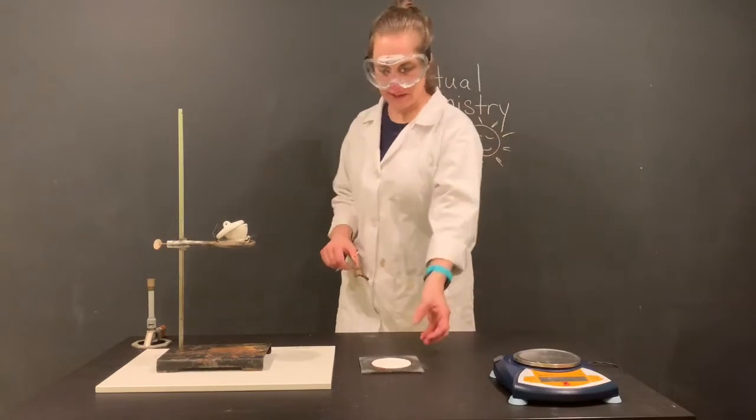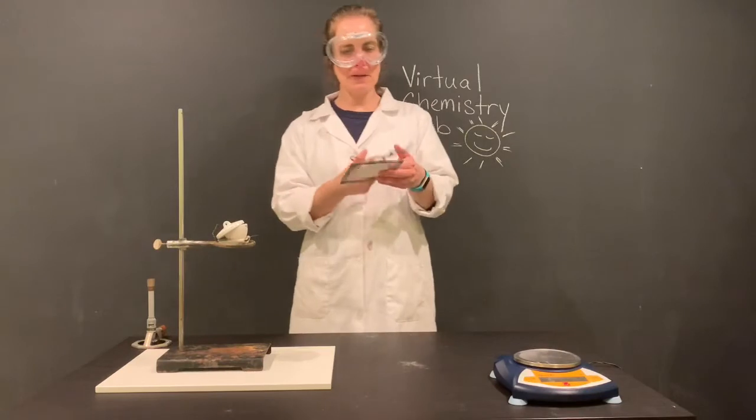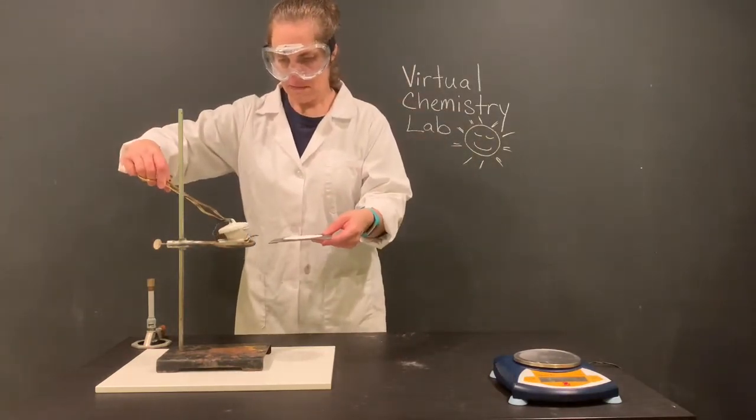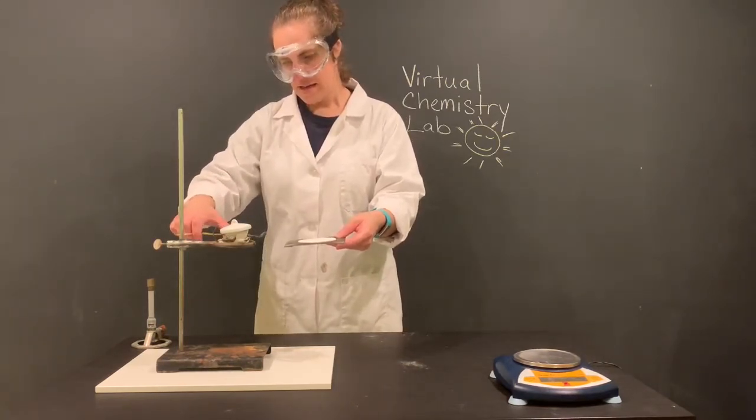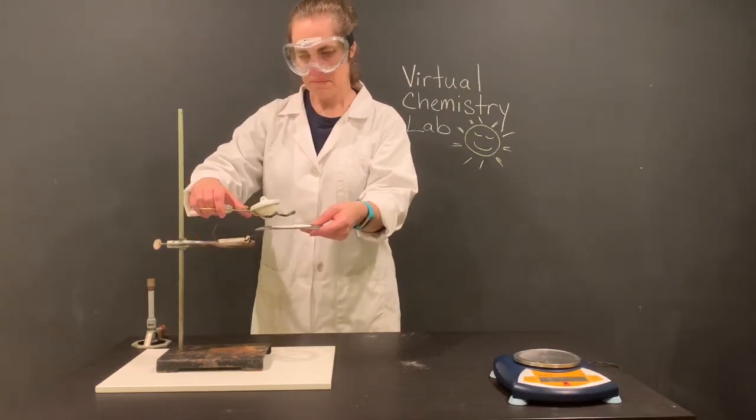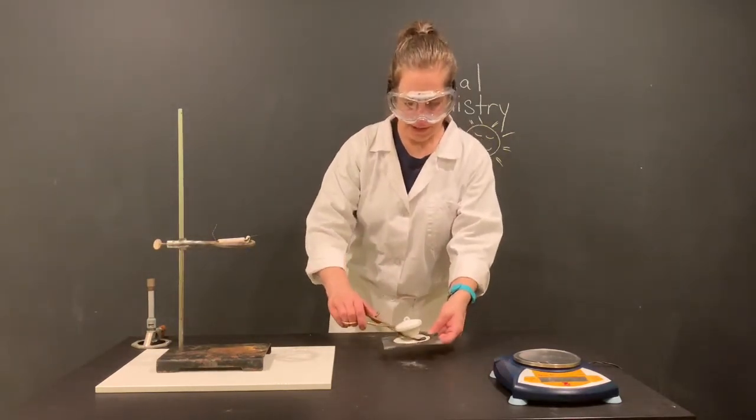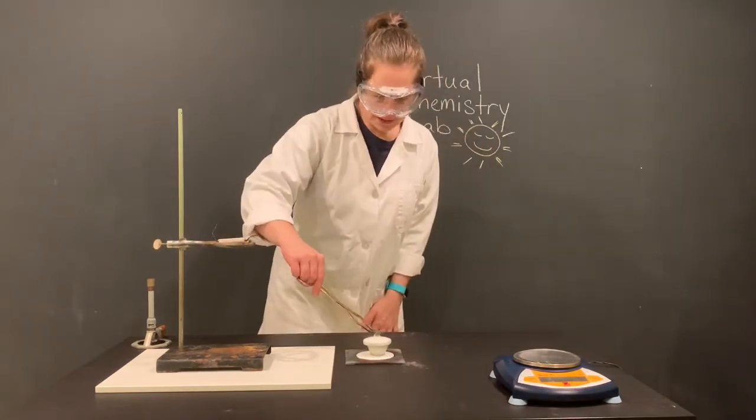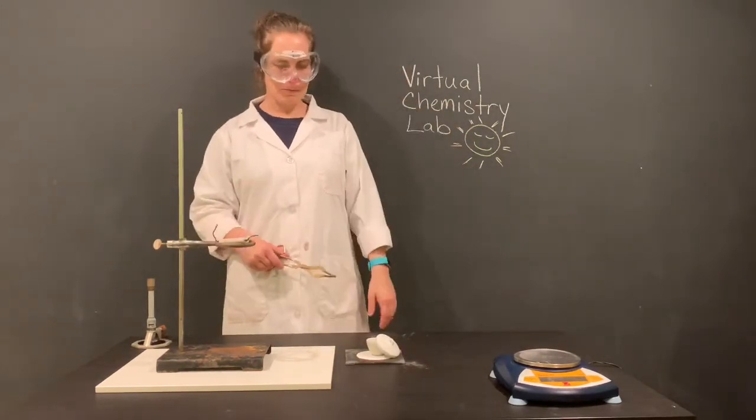So after it's been cooling a little while, now I'm going to go ahead and take it off of the clay triangle using my crucible tongs and my wire gauze. So I'm going to carefully move the top on top of it, and I'm going to come in underneath here and carefully lift the crucible gently between the tongs, and move it to my wire gauze to help with the balance so things don't fall off. I'm going to carefully lay it on my table there, and then I can carefully remove the top if I wish so that it can air out and cool some more.